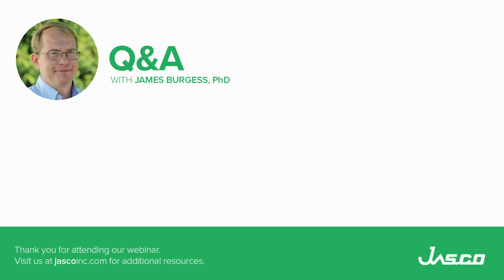If you're using a grazing angle, we are talking about 75, 80 degrees of incidence of the beam. But this question is really good. I didn't want us to leave without answering that.